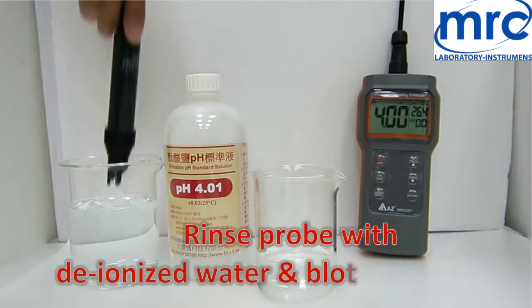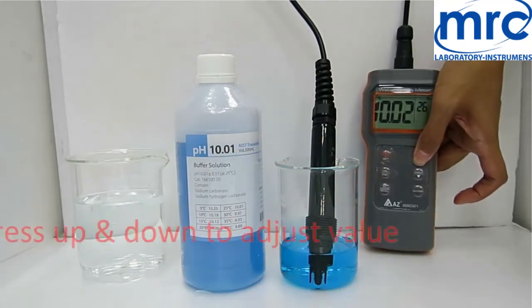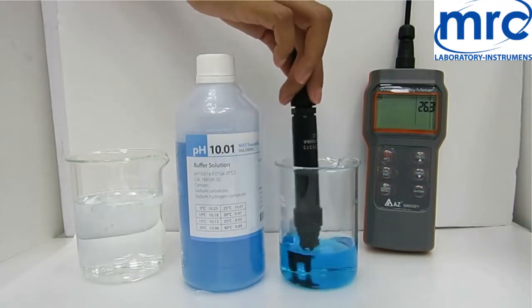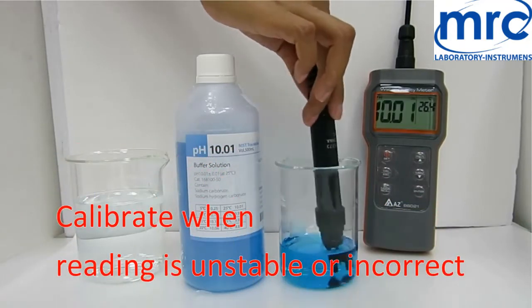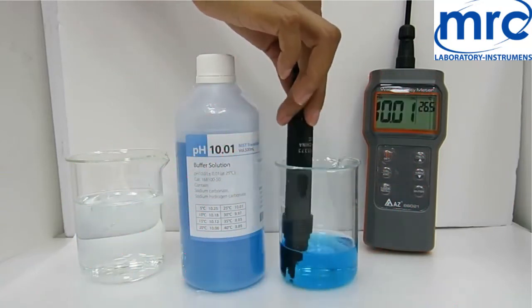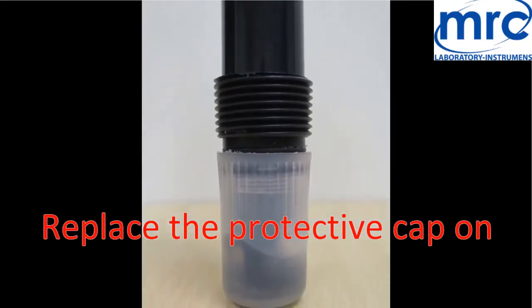Rinse the probe with deionized water after use and blot dry. For pH 10: long press Cal to enter calibration. Set the standard value using the up and down keys. Use a transparent container and make sure the pH electrode is completely immersed in buffer. Stir gently for a homogeneous condition. Do not reuse standard buffer. Once the reading stabilizes, press Enter or wait for the SA icon. Rinse probe with deionized water after use, dry the glass bulb, and replace the storage cap.